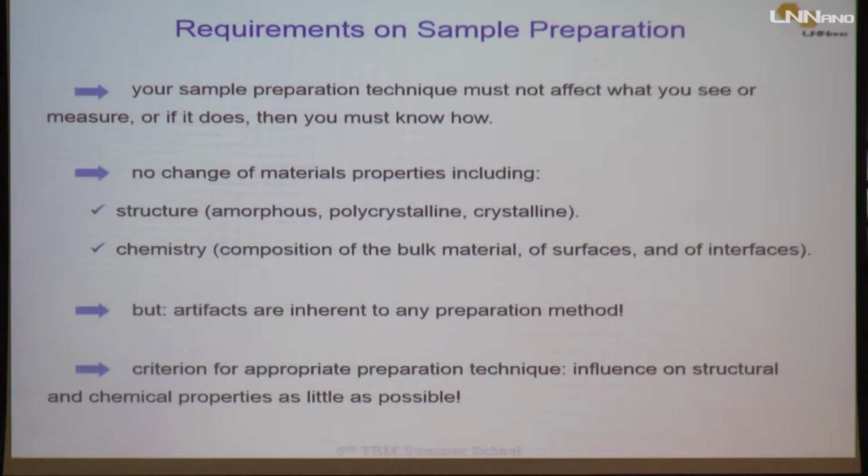If you are dealing with chemical properties, you need to do some spectroscopy, and the sample preparation may be different in this way. So it's very important to know the information that you want from your sample before choosing. It's important to have all this information about your sample as a way to choose how you will prepare it.